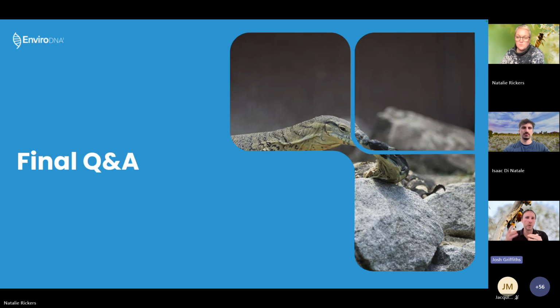So active samplers will get more DNA at a per unit level. The advantage of passive samplers is that they're cheap, easy, you can deploy them quite widely. So when we had arrays of like 5 passive samplers with our active sampler, we were getting very comparable results there. And so the cost per effort is much lower for your passive effectively. Sorry, I don't know specifically about flying insects for that. Yeah, we can try and dig out some data and share that after the webinar.